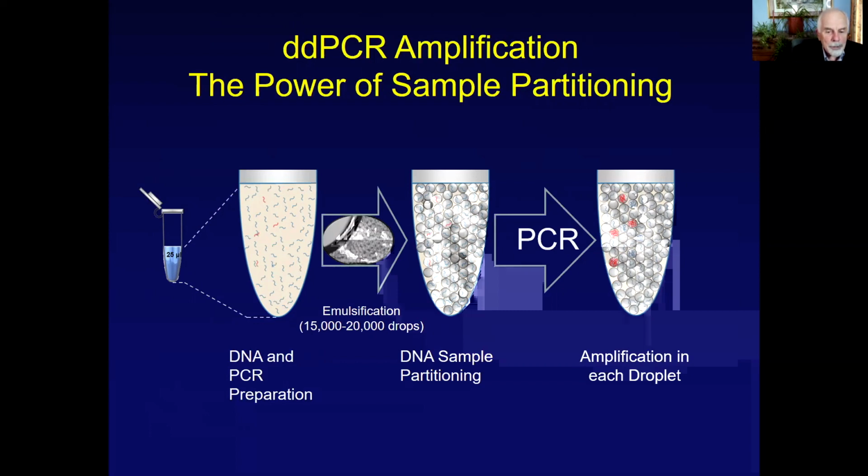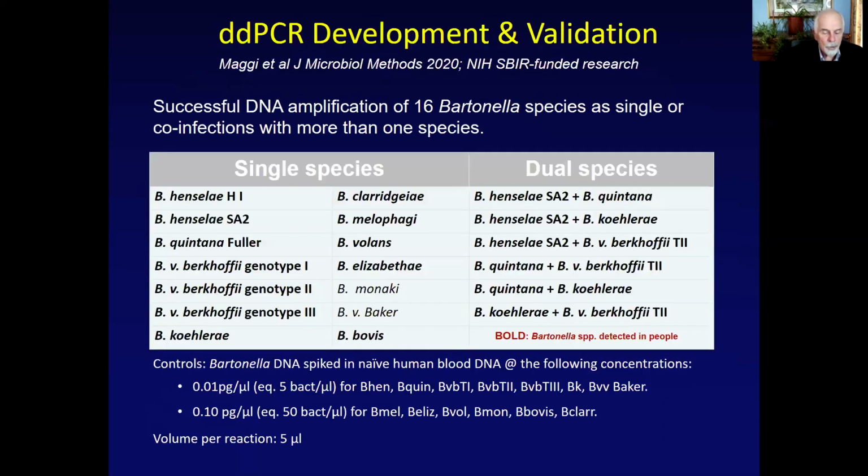So the power of droplet digital PCR is taking these low number of organisms, creating an amplification step, which we've talked about, some way of enriching this, but then by partitioning, we separate out our target from all the rest of this host DNA, which for us diagnostically is junk DNA that just makes our lives more complicated, okay?